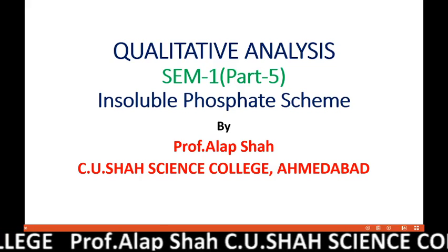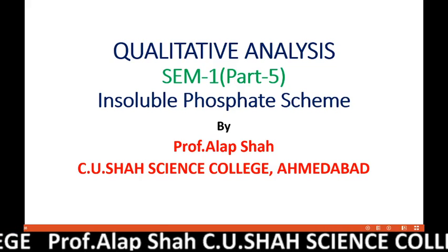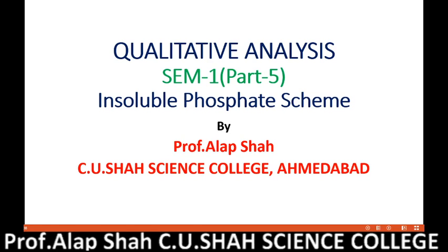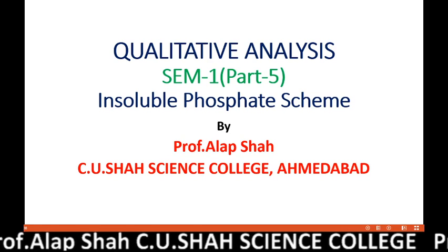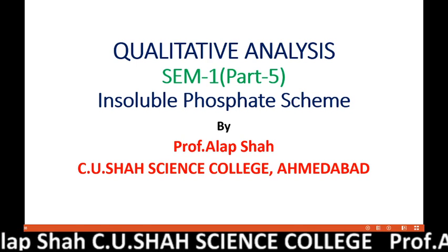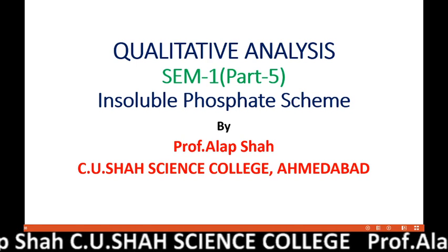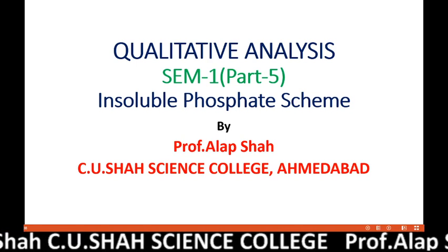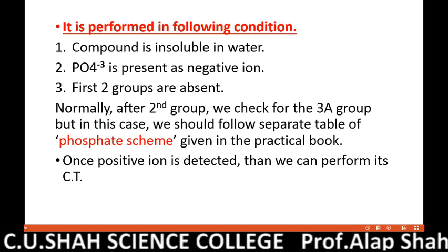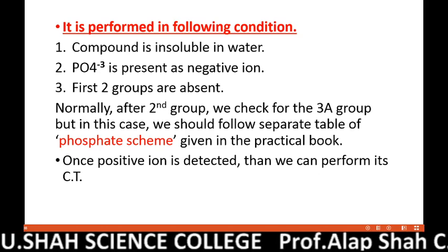Hello everyone. Already in four different parts we have discussed qualitative analysis. But in this part 5 we will discuss a very important point which is called insoluble phosphate scheme. This is a very important point. Now the name itself suggests this is called insoluble phosphate scheme.